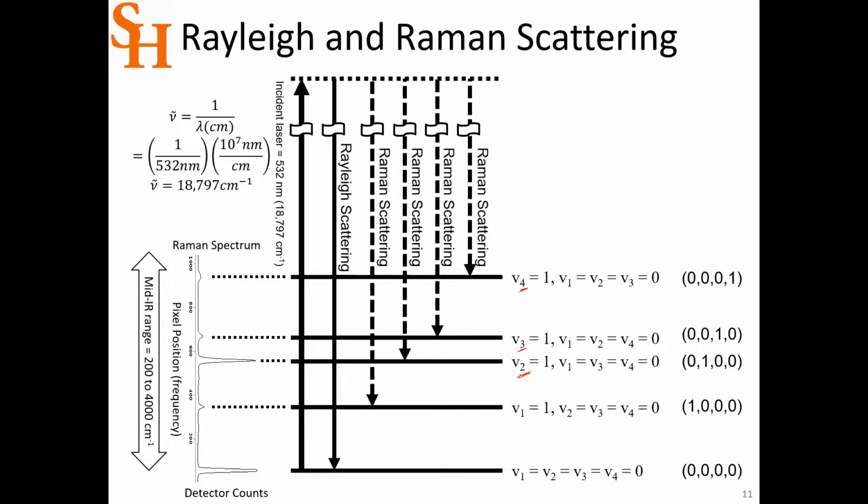And then another skill that we're going to learn this week is how to stack plots. And so you've done well in learning how to plot your wave functions and so on. But this week we're going to have 4 spectra that are simulated. So we'll have the Gaussian simulation of the Raman and the IR for both chlorobenzene and for benzene. Now it would be nice to have all 4 of those on the same plot. But if they're all starting at 0, their peaks are going to be overlapped. And it's going to be very difficult to see the spectra.